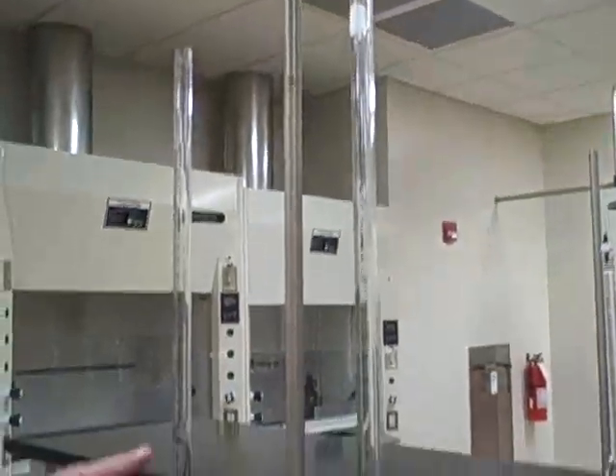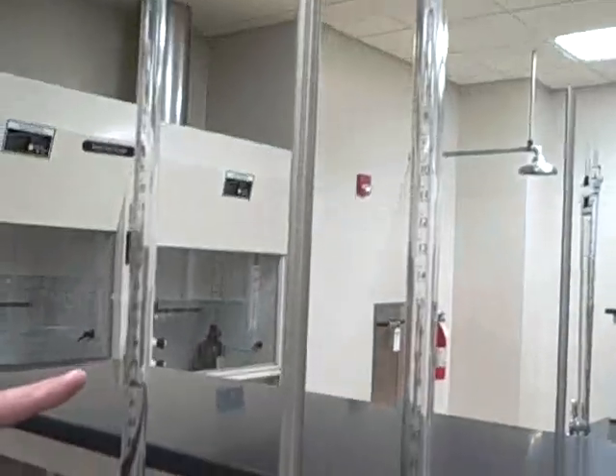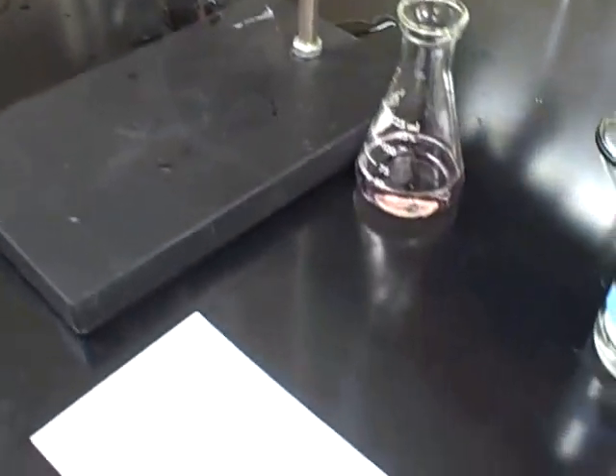This counts as one run. Students are supposed to do two runs, and you can see you actually have enough left in the burettes to do another run — you could put in another 20 milliliters and get another run done. So they should have plenty to do two runs, and then they can calculate an average and standard deviation.